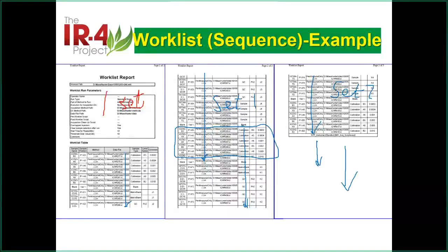Okay, so the question here, next one, is when standard calibration before and after differ significantly. Dr. Suri asked the question there. If you see some curves difference, what do you need to do? Well, this is happening all the time.